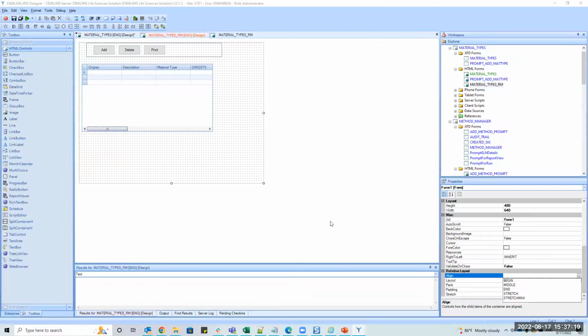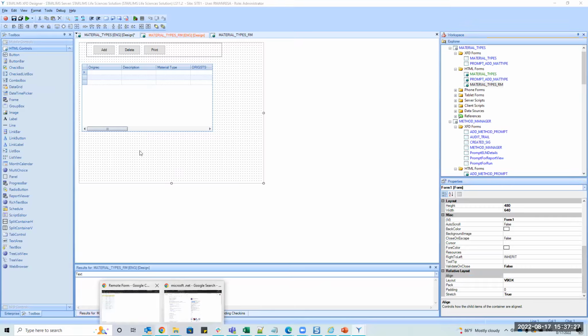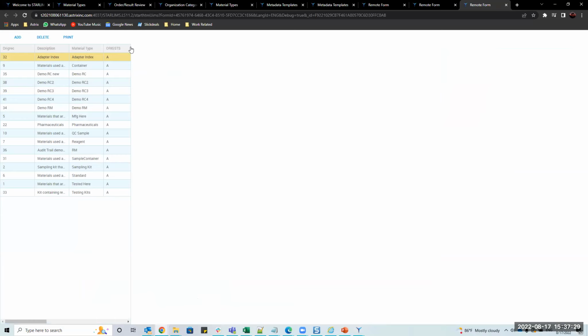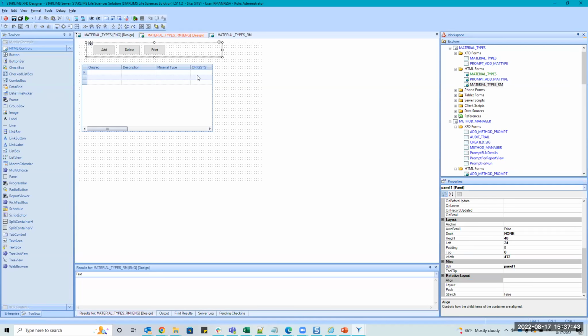Let's see. You know what, I'm playing around without giving you the PowerPoint. But this is what we're going to talk about in the PowerPoint, right? These relative layouts to make this pattern of buttons, grids and things stretching and looking correct, right? So this is all new, and I feel like a lot of people struggle with it because, again, the way it's implemented is kind of strange.